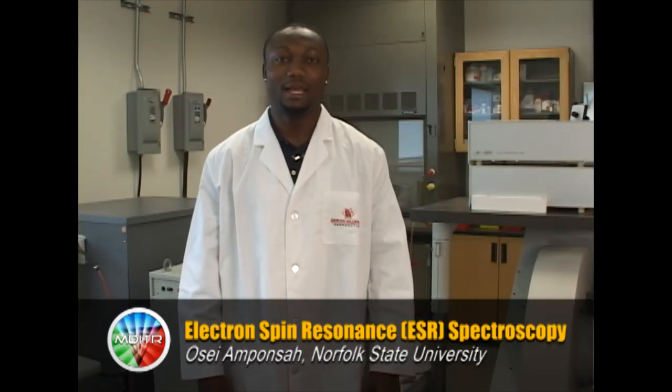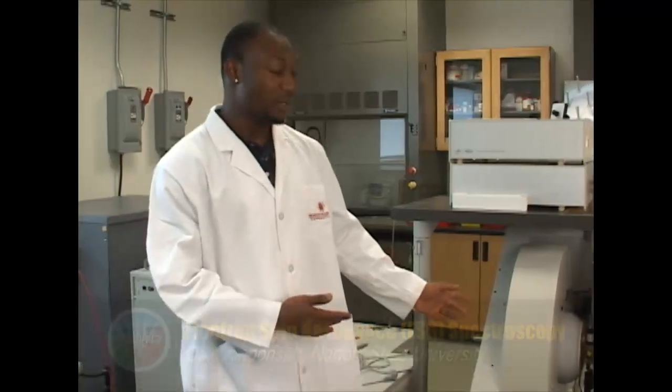My name is Osei Amponsan and this is Norfolk State's Center for Material Research Lab. This is our electron spin resonance lab and today we're going to run some materials in electron spin resonance spectroscopy.